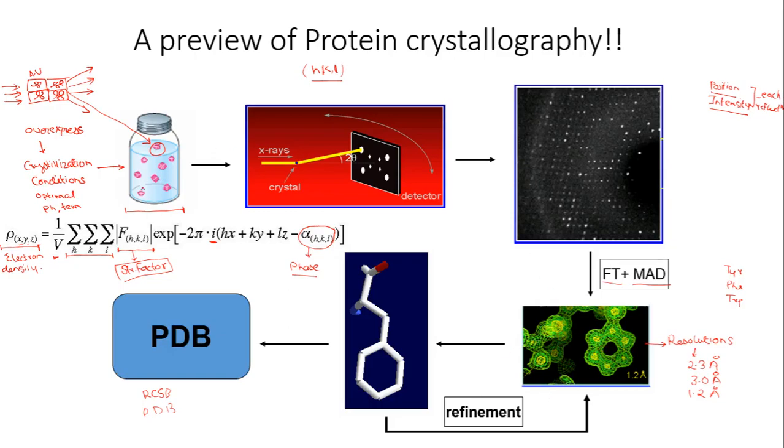Okay, so this is the overall process of crystallography. What you have is this. And we are going to study the models of various proteins in our subsequent lectures or practicals. So what we would mostly be manipulating and playing around with is the model.